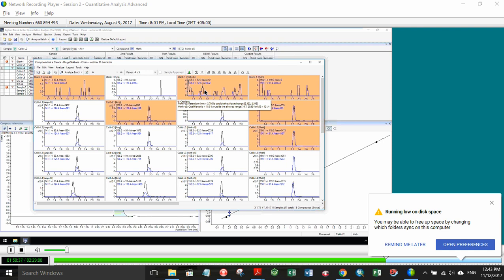Okay, the next question in the queue. In ChemStation, there was an option to save an analysis to a quantitation database. Is there a similar or equivalent feature in MassHunter other than appending a directory where the batch is created? I don't know if I understand that question. Let me read it again. In ChemStation, there is an option to save an analysis to a quantitation database.